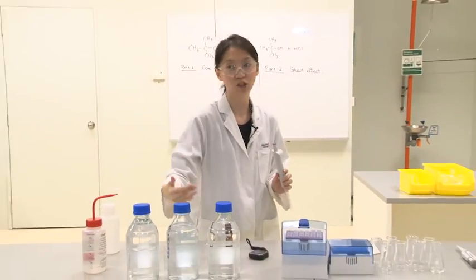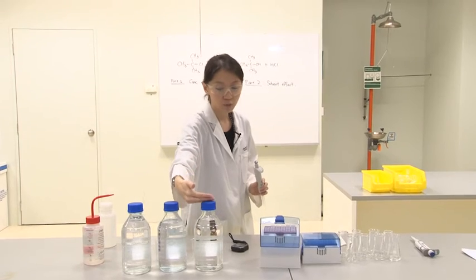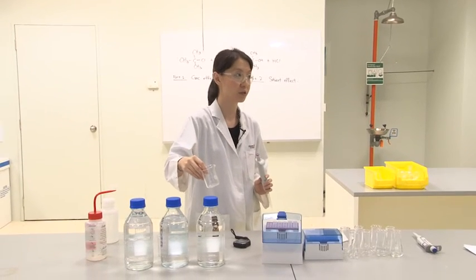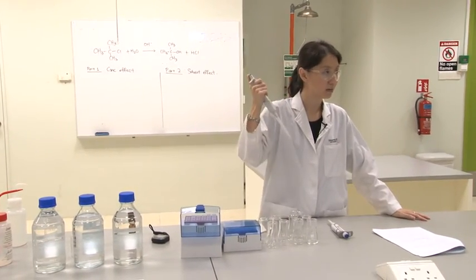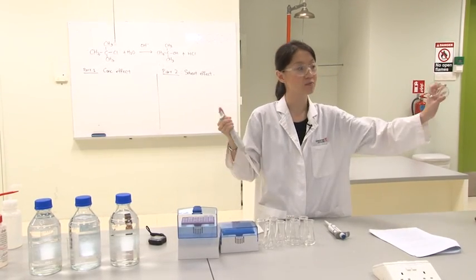So when you take the reagent from the bottles at the side there, you basically pour out a bit into the beaker first. Don't pipette directly from the stock solution, okay? So after you pour out, you bring it back to your bench, and then you just use a micropipette and transfer to the flask, okay? So when you pipette, what else must you take note of?